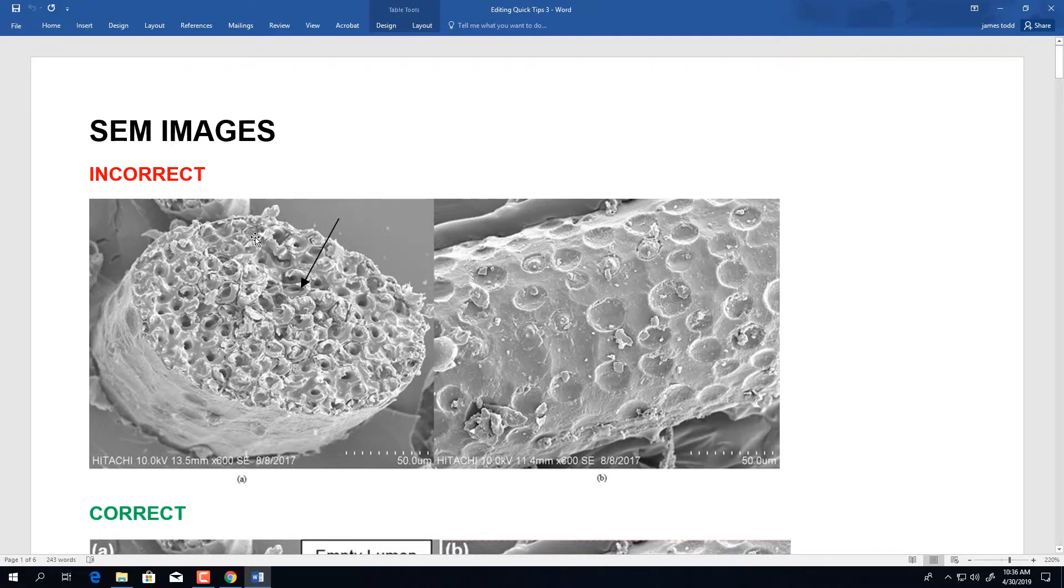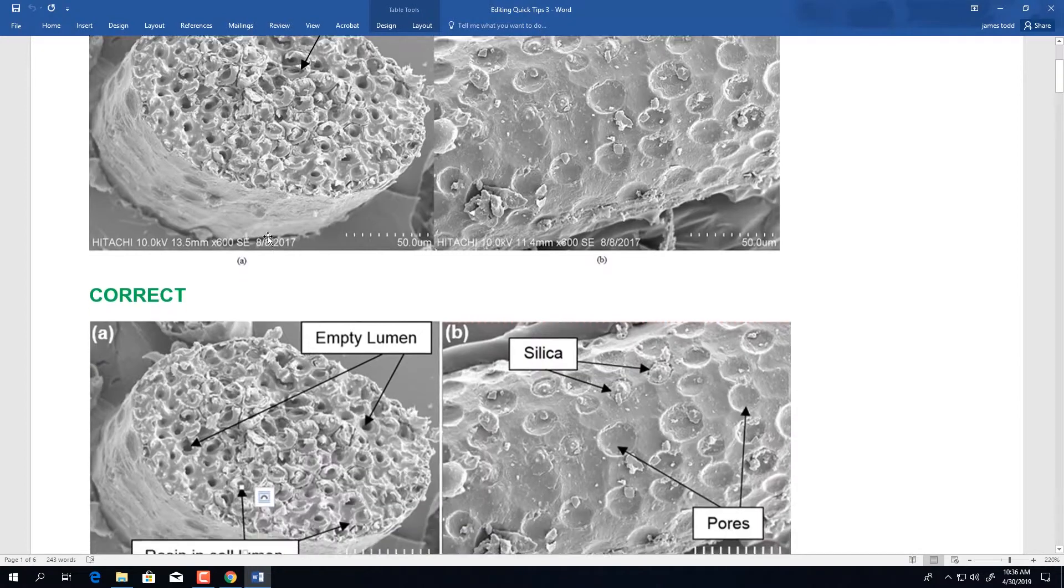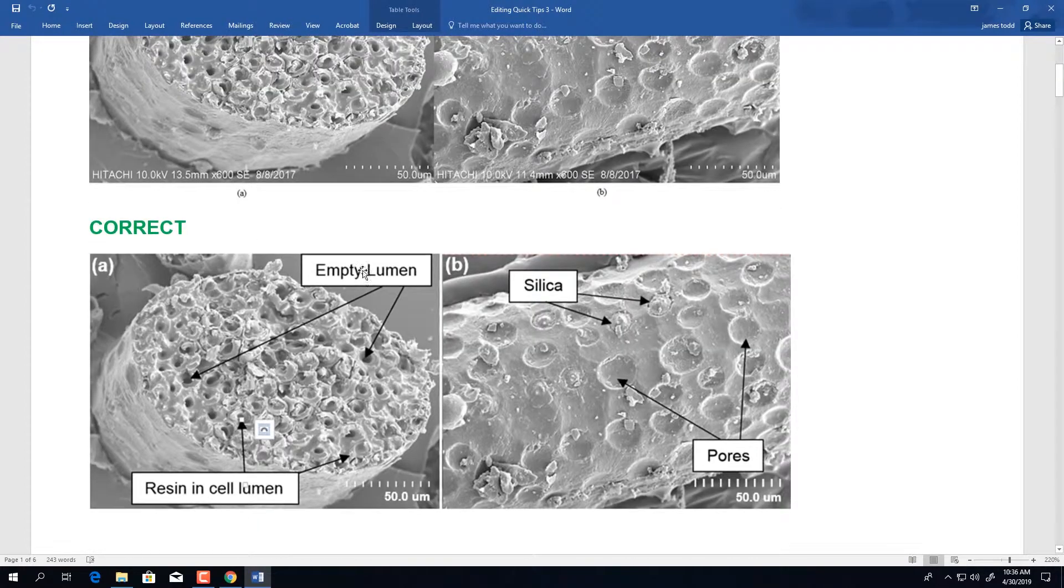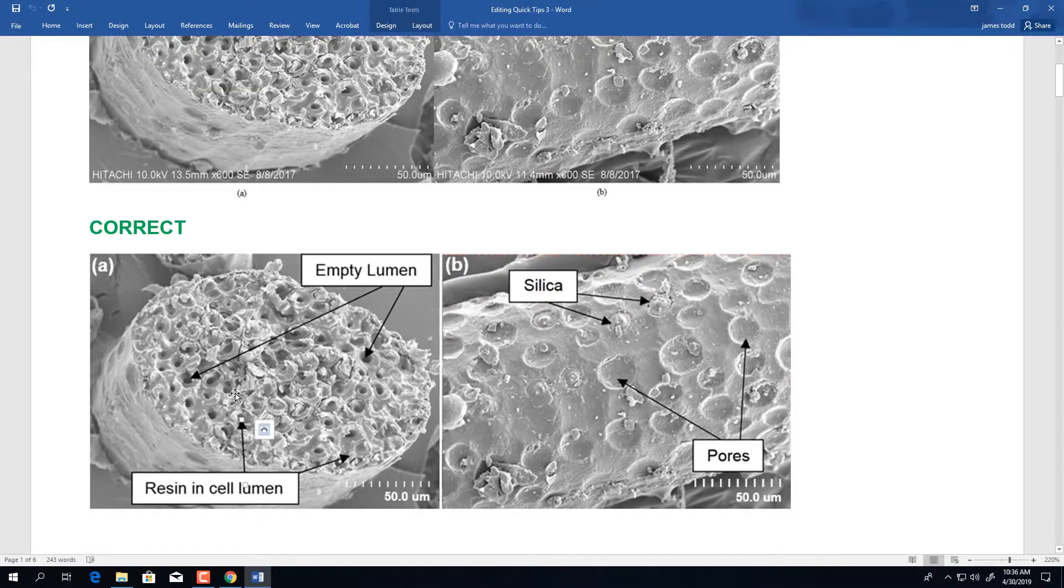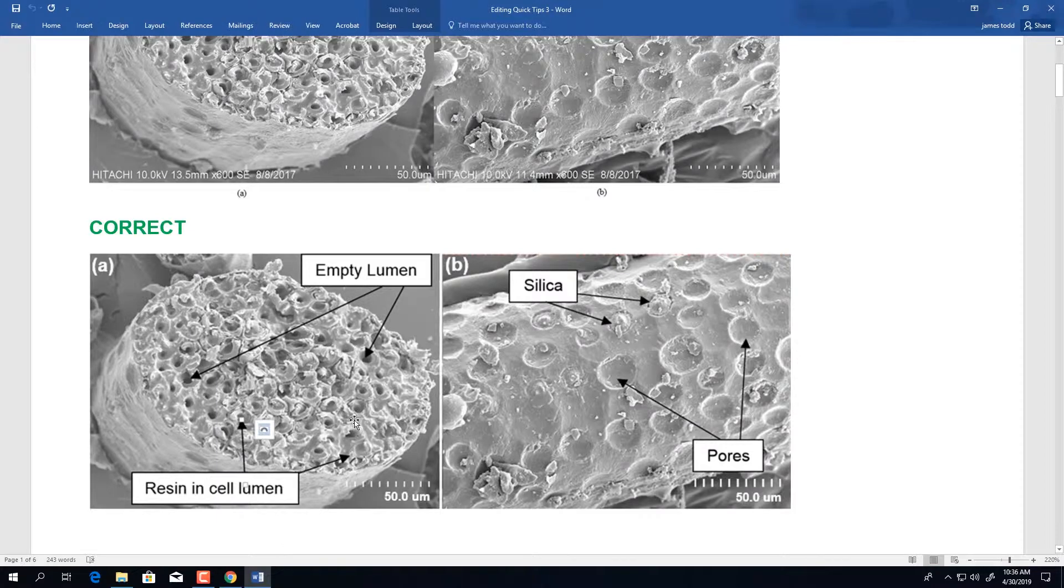The correct version of this micrograph is below. Notice where the arrows point to information. There are texts that clearly delineate what is being referenced. The font within the image is legible in Arial size 10 font or larger.